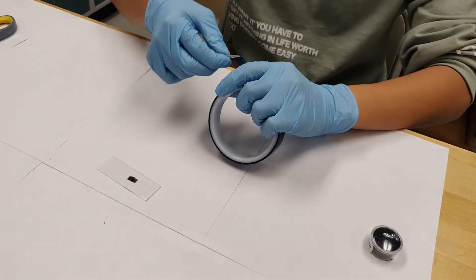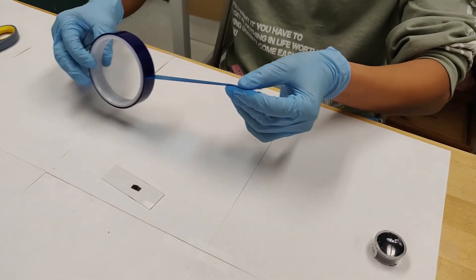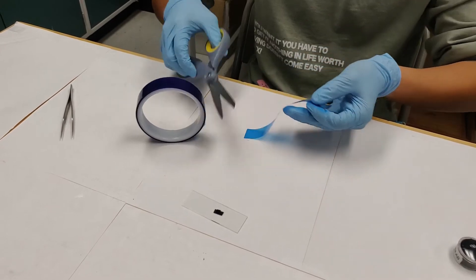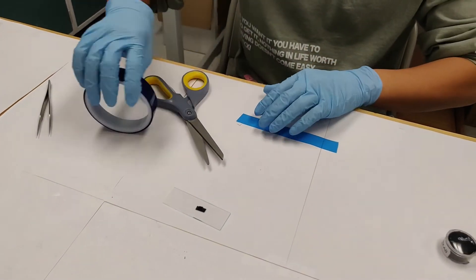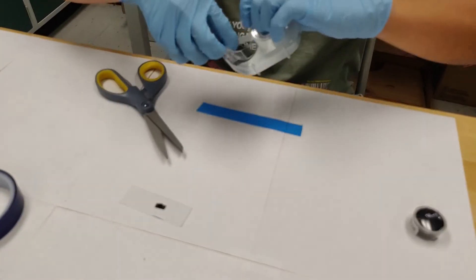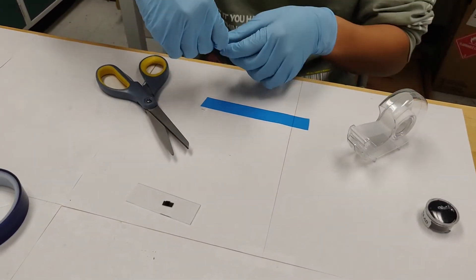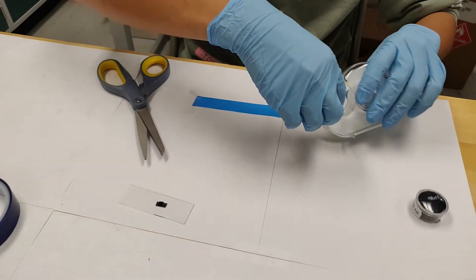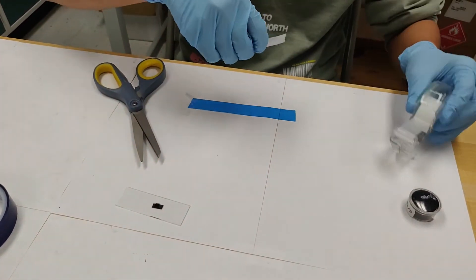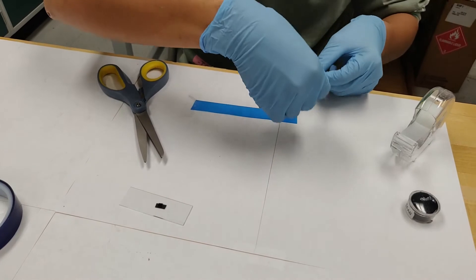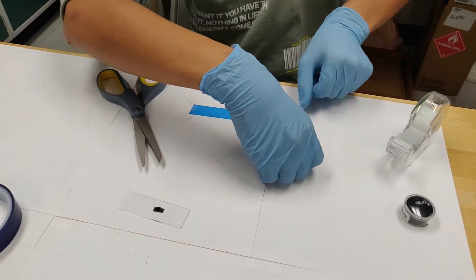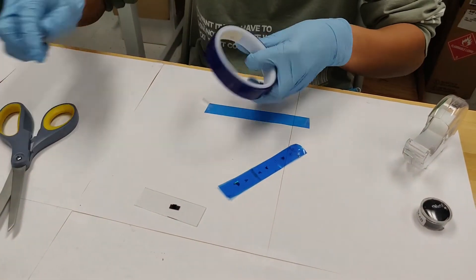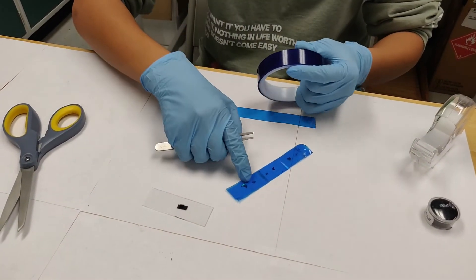Then what you do is cut another piece of tape and tape this one down. Then you cut one more piece of tape that you will use to take off this piece of bulk.